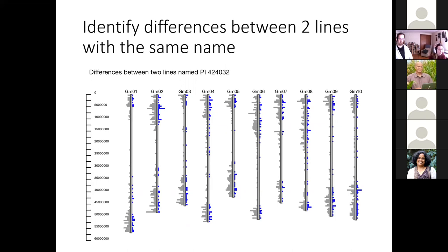In contrast, two accessions both labeled PI 44032 show differences across all 20 chromosomes, not isolated to any one region. Contacting the collaborator confirmed the line was mislabeled — the differences confirmed that these two accessions, despite sharing the same name, are not the same, confirming the error.